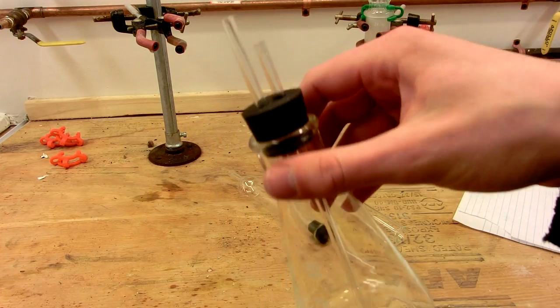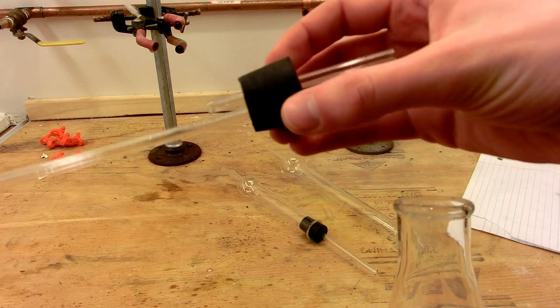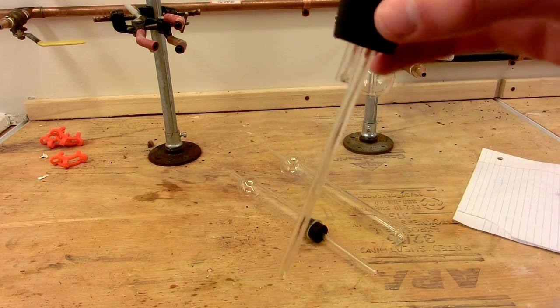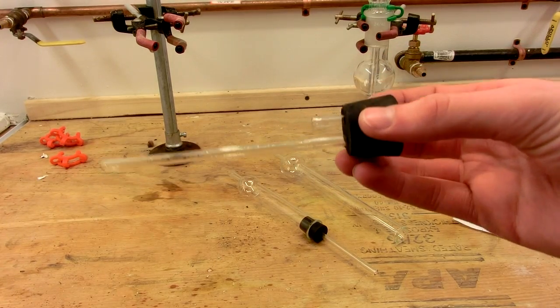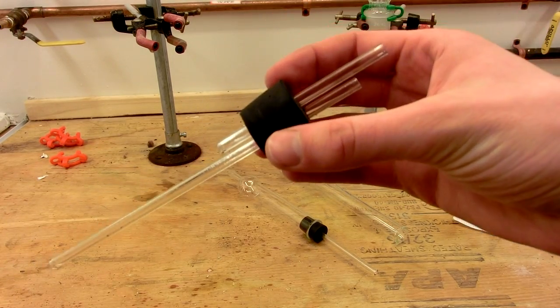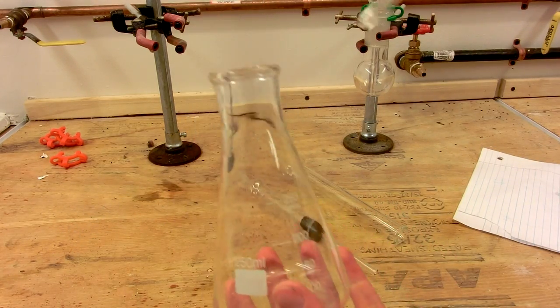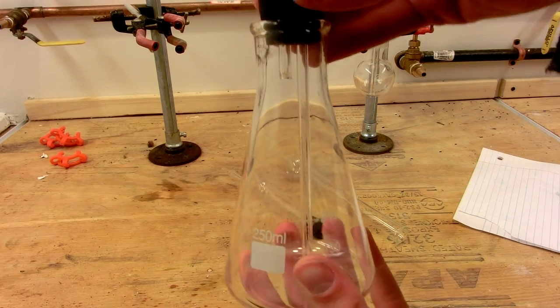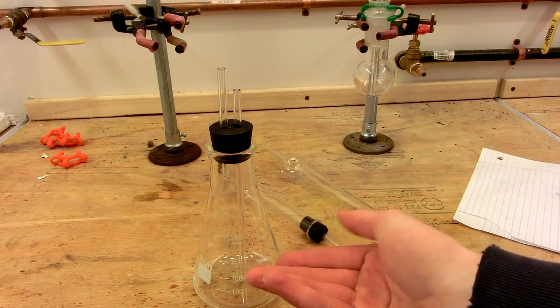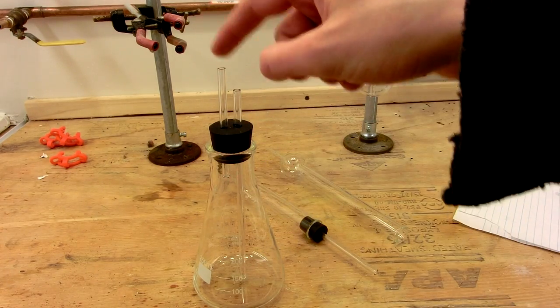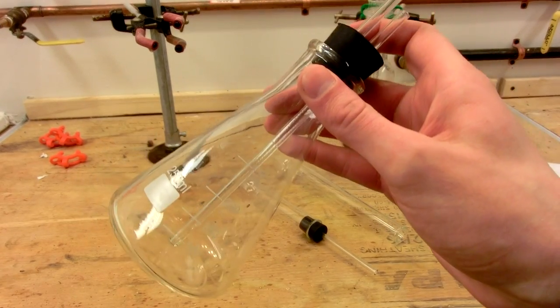This right here is an example of a suckback trap. It's just an Erlenmeyer flask with two different lengths of tubing in it. Now a suckback trap doesn't necessarily have to have one long piece of tubing and one short piece of tubing. You can also have two short pieces of tubing. But this also doubles as a gas drying apparatus, because I could, for instance, put solid desiccant into this, and then wiggle this tube down through the desiccant, and as long as I fed gas into the long tube, where it would go all the way to the bottom, and then travel up through the desiccant, I could get dry gas out the top. So this has a dual function. It can be a gas dryer or a suckback trap.